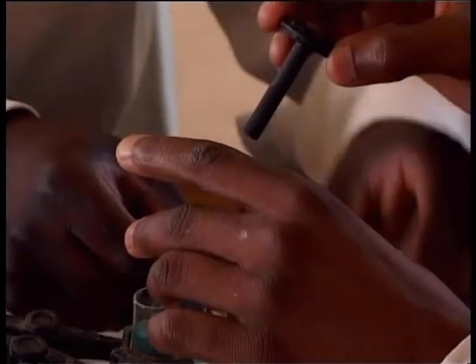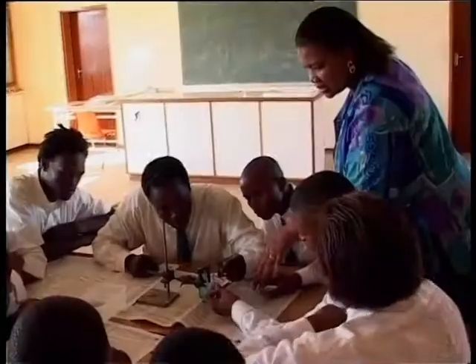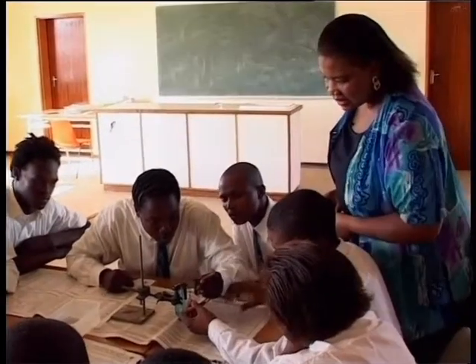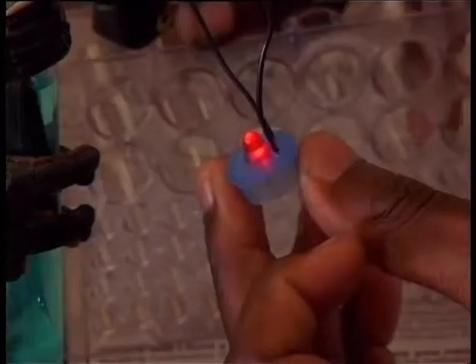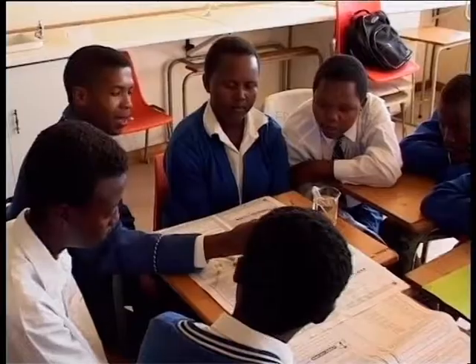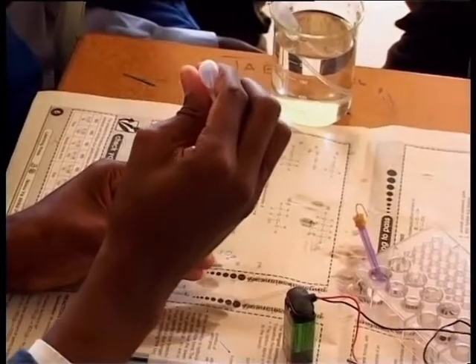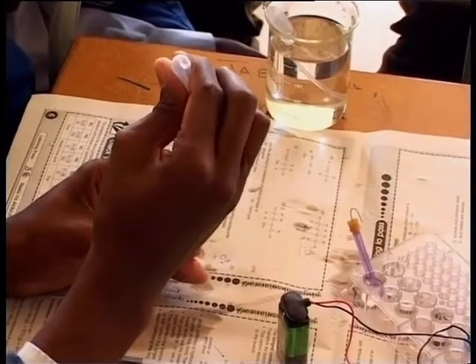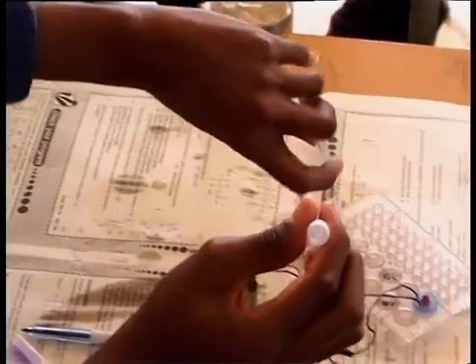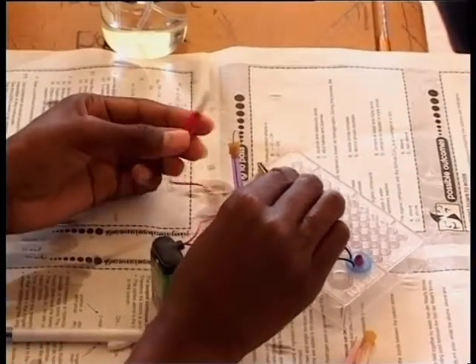At the second stage of the circus of experiments, the learners pass an electric current through a solution of copper chloride. They will deduce what chemical change has occurred by observing any changes at the cathode and anode. In the final stage of the circus, the learners conduct an electrolysis of water experiment. The learners investigate the effect of passing electricity through water and use their knowledge of the chemistry of water to deduce which gases are released at the cathode and anode.